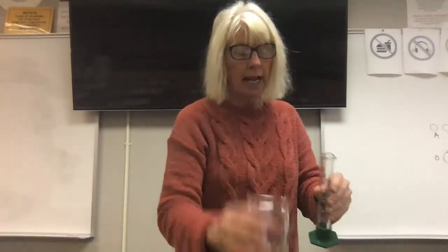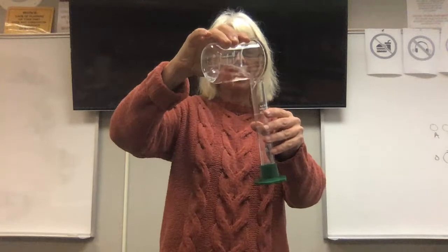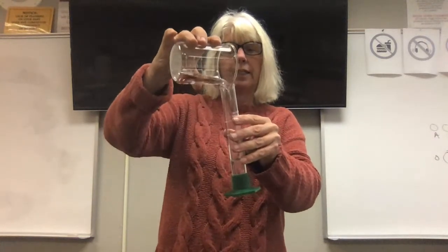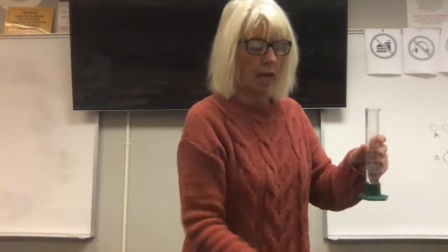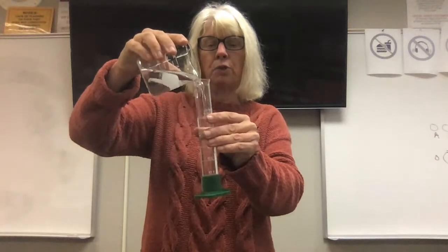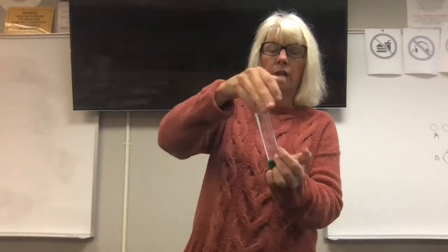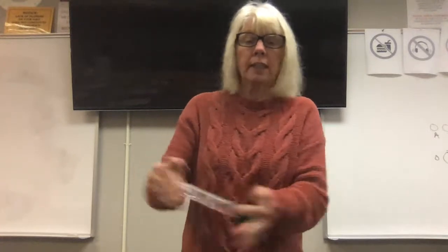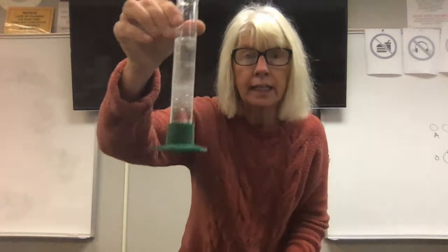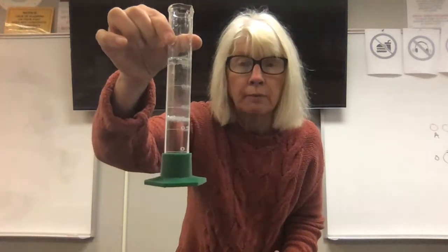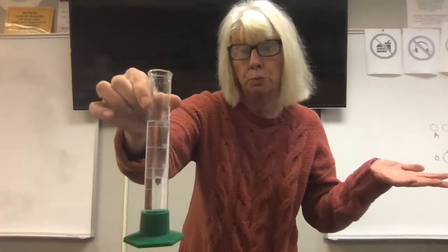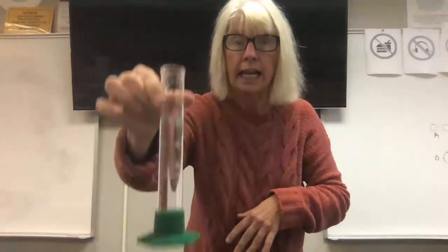So I'm going to add the TTE, and then I'm going to add the water. Since you don't know the density, you won't know what's on the top or what's on the bottom. And you see that when I mix them together, they separate. That's because water is polar and TTE is nonpolar.